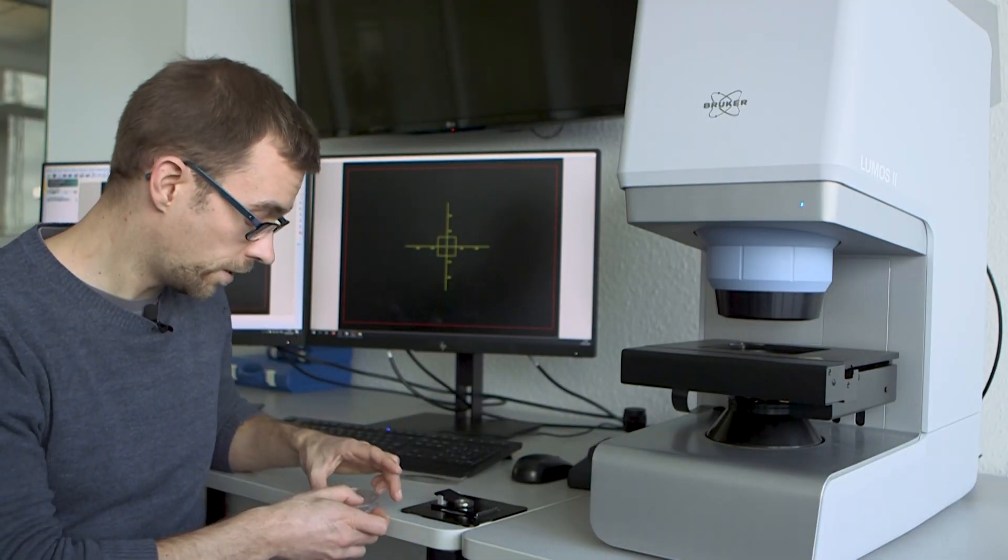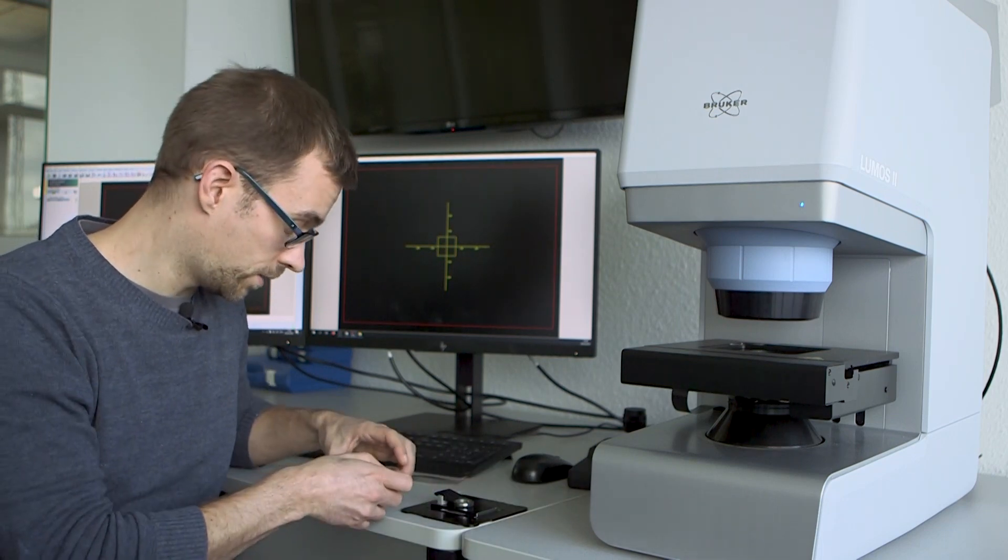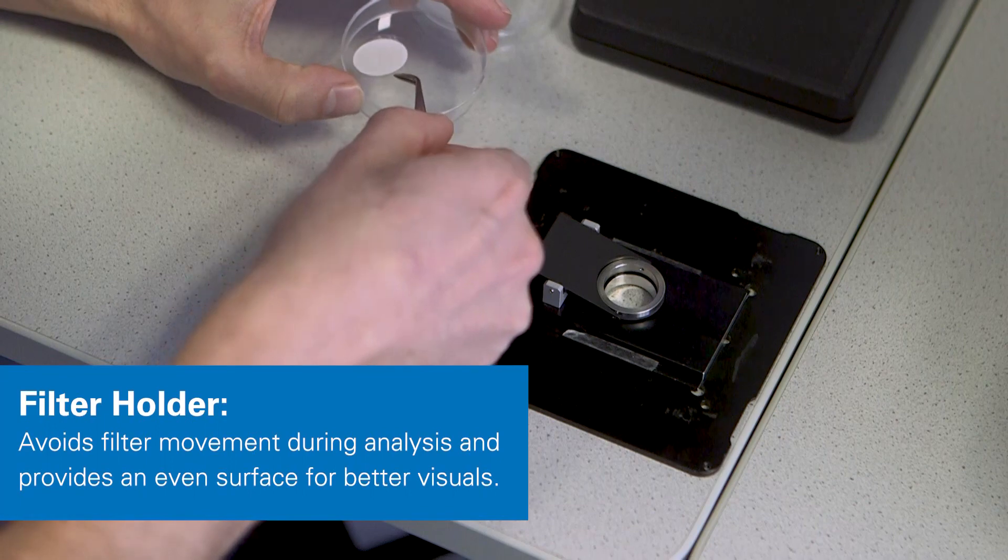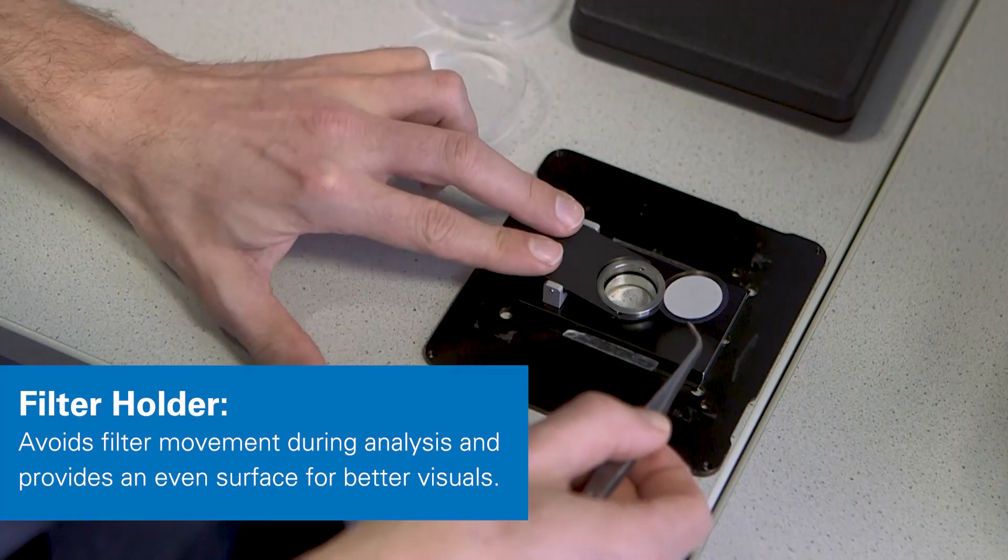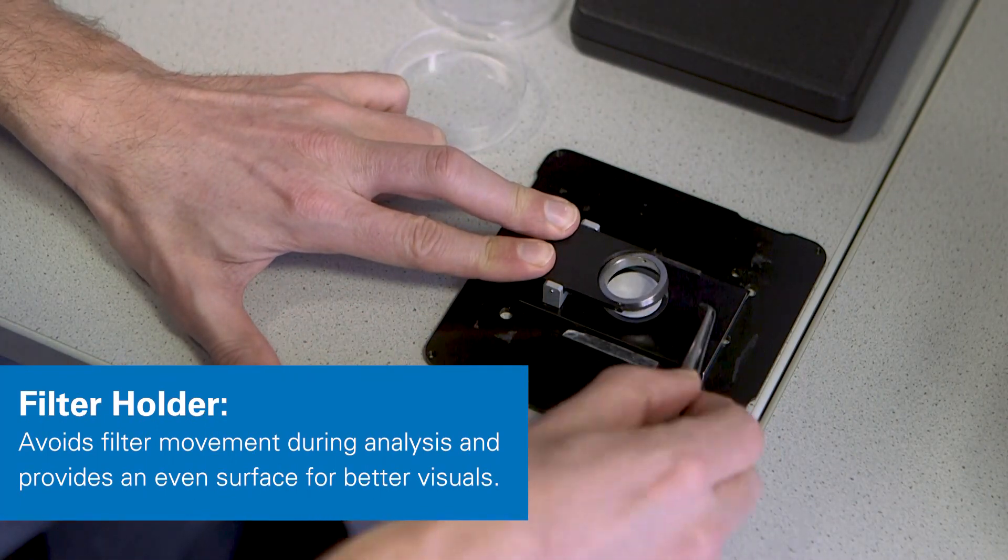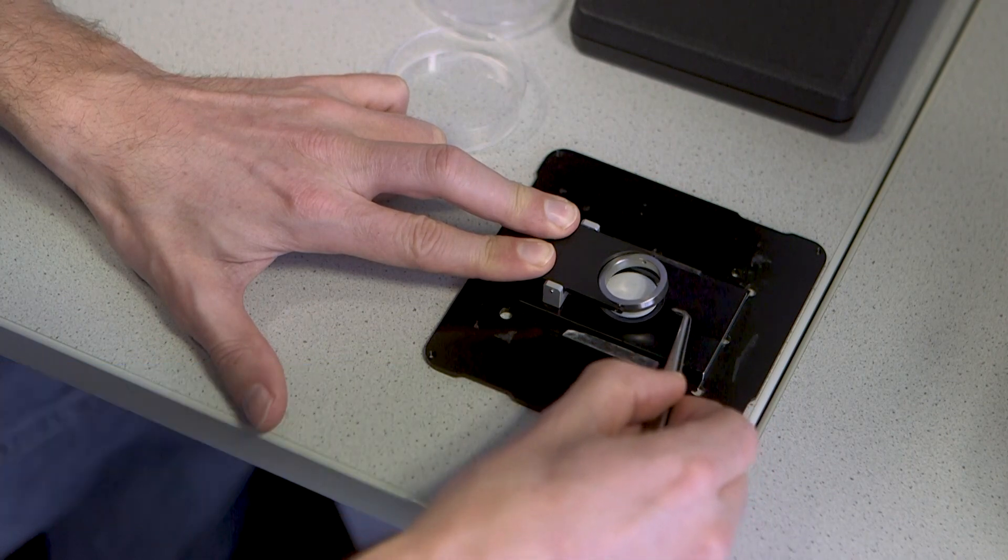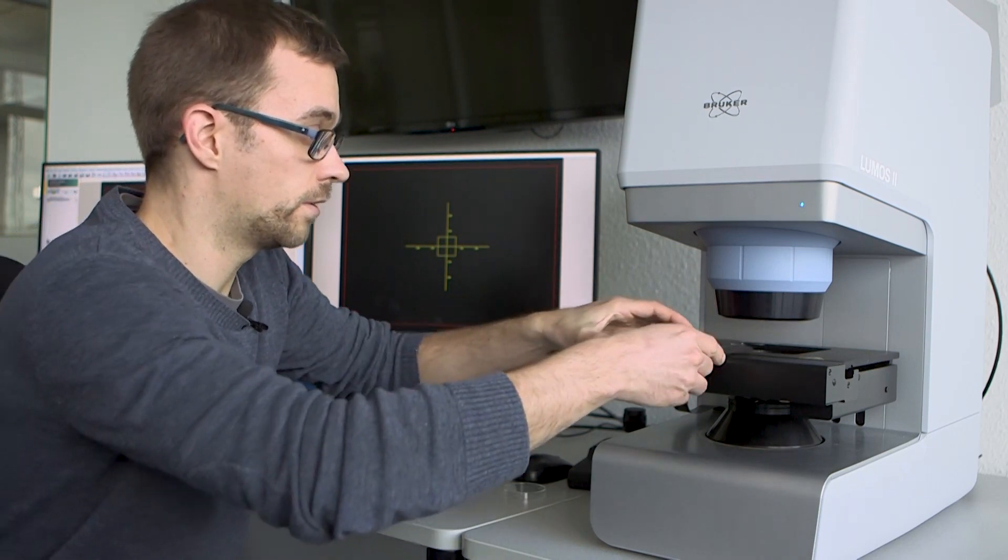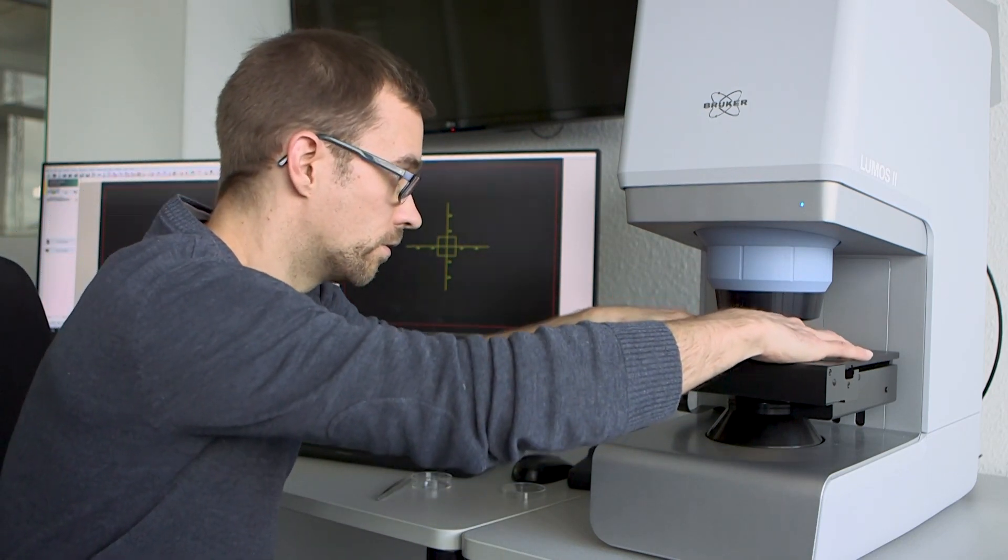Now that our sample is dry, we can place it in the filter holder to fix it for the measurement. It's an easy to use tool, you just lift this clip, place the filter, release and you can place it onto the microscopy stage.